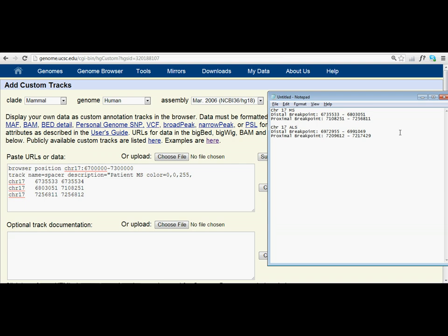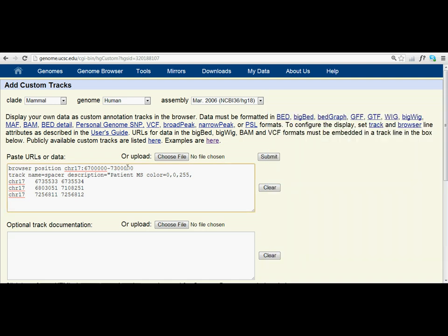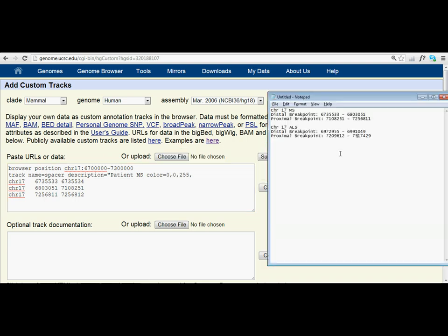However, say for example, if the proximal breakpoint became 7517429, we'd want to increase the browser position to include 7517429. So we might make it 76. But let's go back and just keep it simple.